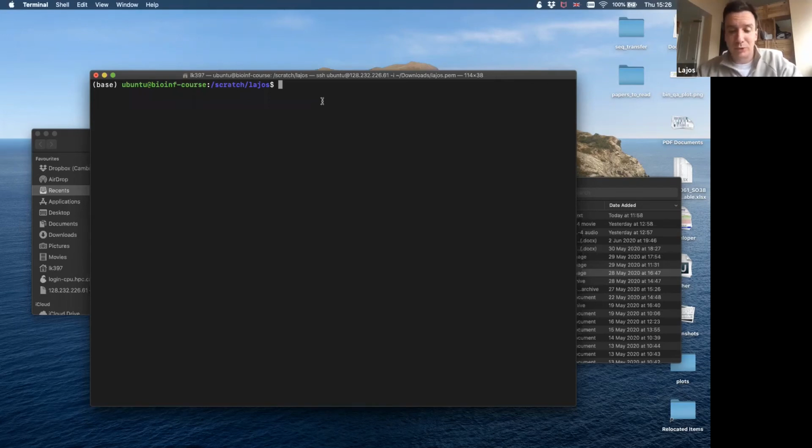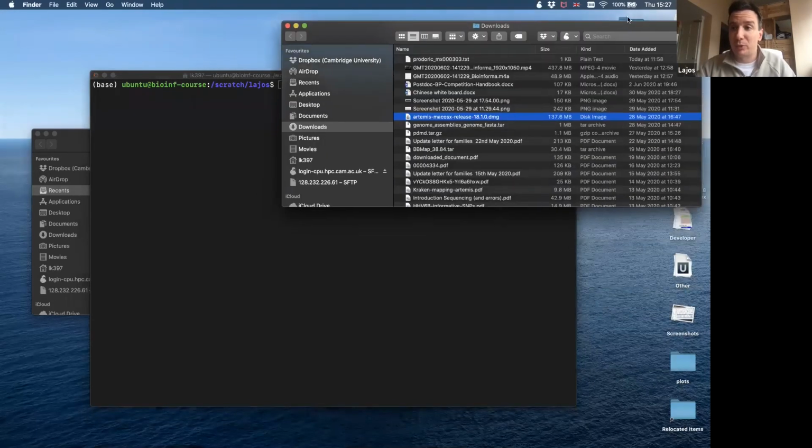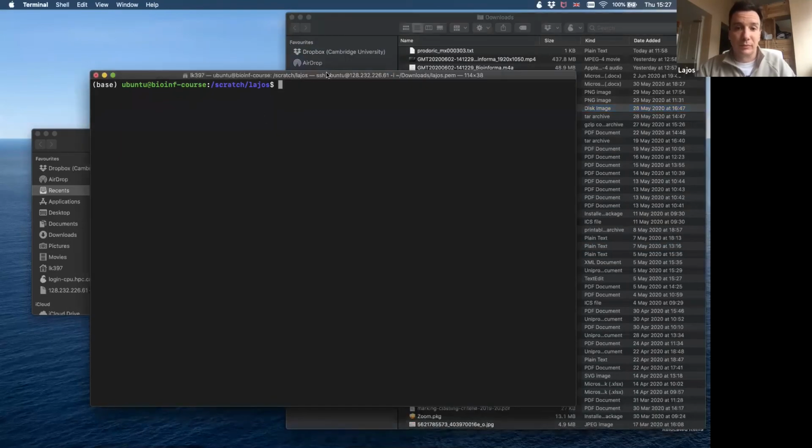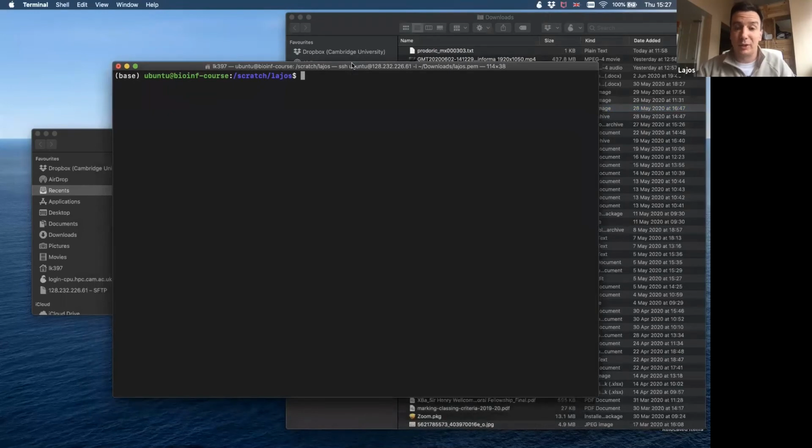But as soon as you want to go into a bit more detail, if you want to find a sequence, a gene, a domain, or anything like that, and you don't want to do this manually one by one on a website, for example BLAST on the BLAST website, because you have hundreds of sequences, then this is the way you will do this.